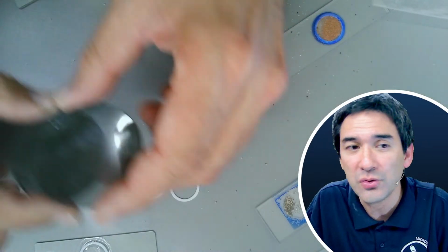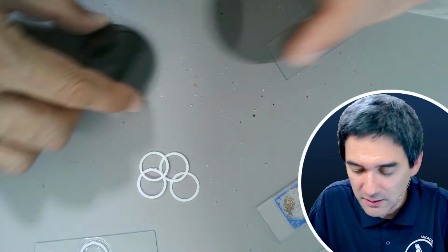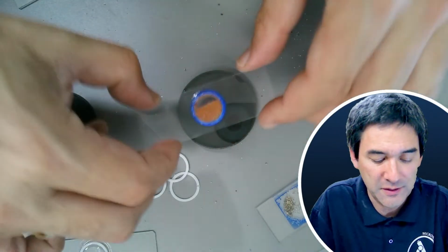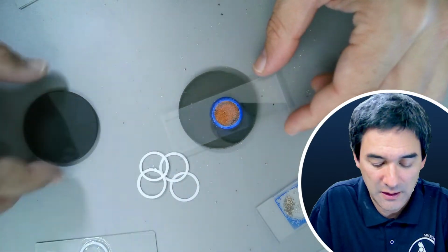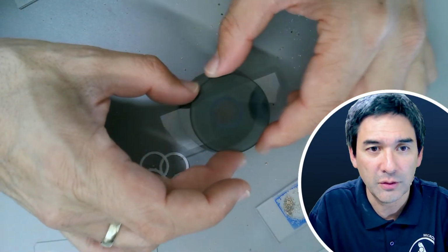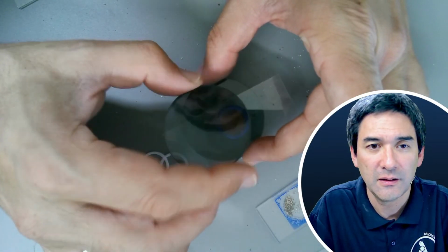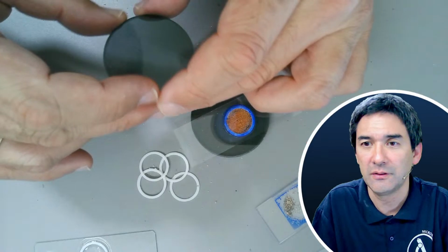Stingray is asking, are you using 2 filters? Yes. Look, you do the following: you put one filter on the bottom, you put the sample over it, and you put the other filter on top of it, and then you rotate the top one. And that's basically what I've done.